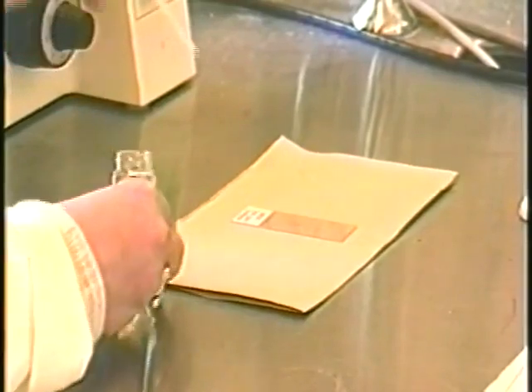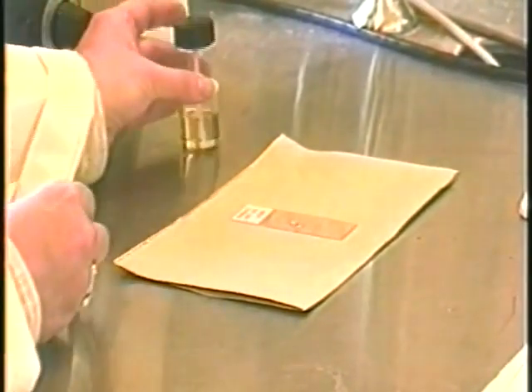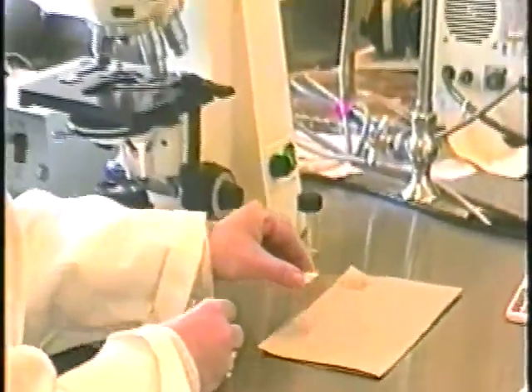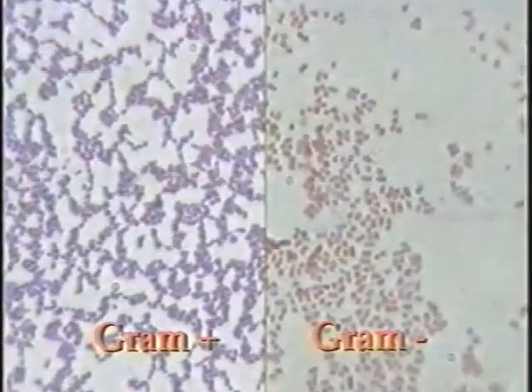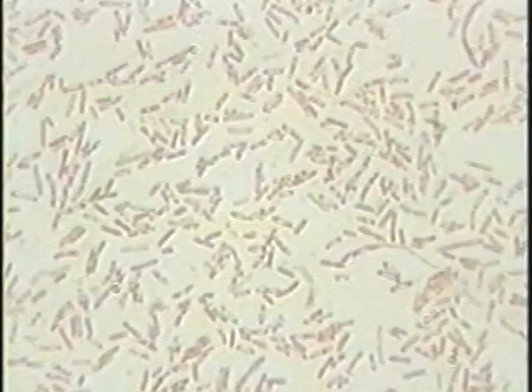Finally, place a drop of microscope immersion oil on the stained smear and examine using the 100x oil objective. Gram-positive cells will appear blue to purple and gram-negative cells are red. If some cells are red and others blue, this may mean a mixed culture of bacteria, incomplete decolorizing, or that the culture was old. When examining for gram staining characteristics, also note the shape of the bacteria, as this is an additional differentiating trait.